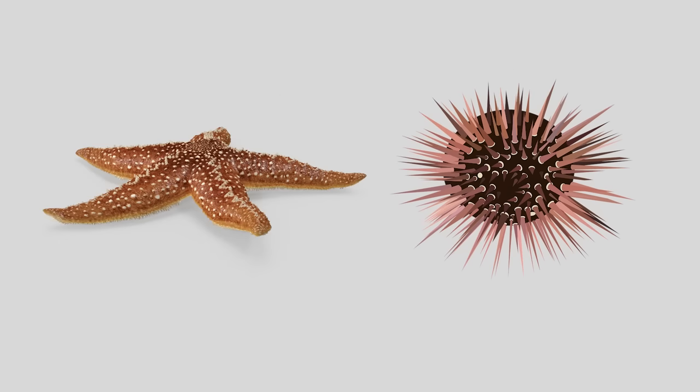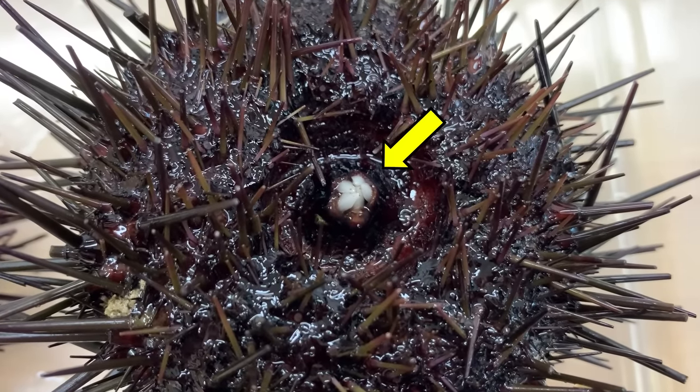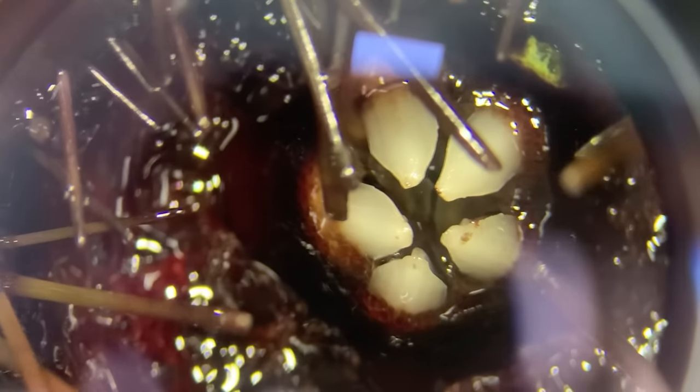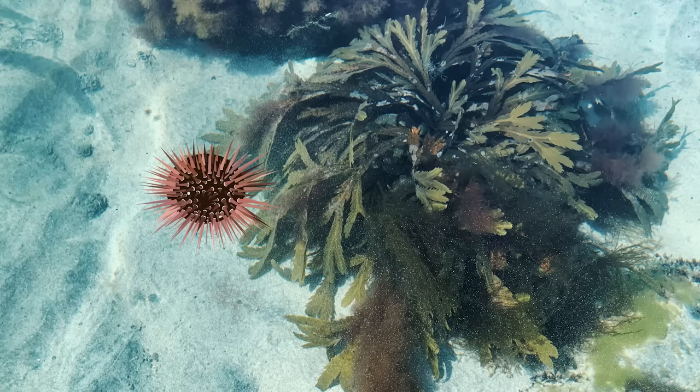Like starfish, sea urchins have a mouth and anus located at the bottom and top of the body. You can see 5 teeth in the mouth of the sea urchin. If you zoom in on their teeth, you can see how they look. Sea urchins feed on seaweed with these teeth, which is why they are often found near seaweed.